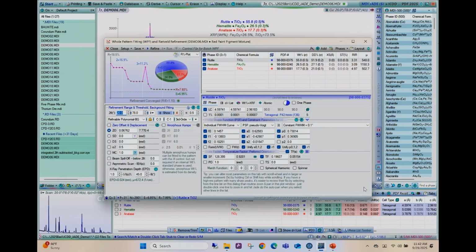The positive of this is I can cycle through samples, boom, boom, boom, boom. I think we heard Robert say he didn't like a certain graduate student, so he gave that graduate student 500 samples to analyze, okay? At this point, the graduate student is now drinking his Peroni, sitting by the curb, enjoying life, okay?